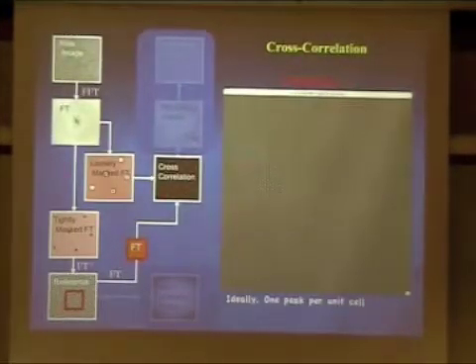Now we have two different maps. One shows the distortion, one shows what the perfect crystal should look like. What you want to do is a cross correlation. As Bob mentioned, correlation is a kind of convolution. Yes, I remember hearing that.